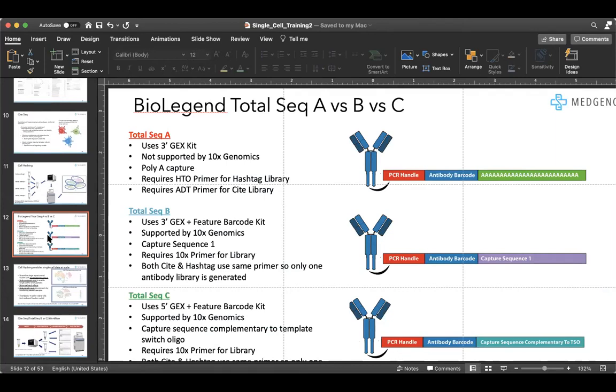Yeah, totally. That's a great question. So I think Angelica and Olga also just refer people to the BioLegend website. They have a lot of antibody oligoconjugates for sale, including hashtag and for Cite. The drawback there is most of them are immune cell based, but they've all been validated. They all come at a concentration that's optimal for staining cells. So for the most part, we just steer them there to BioLegend's website.